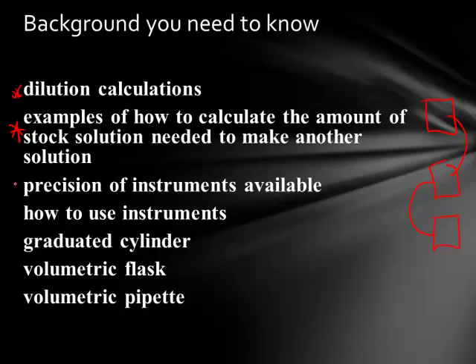to do that. You're going to want to give some thought to the precision of the instruments made and to how you can use those to most accurately produce solutions of the correct concentration. And there are several measuring devices you can use, and we'll take a look at how to use each of those.